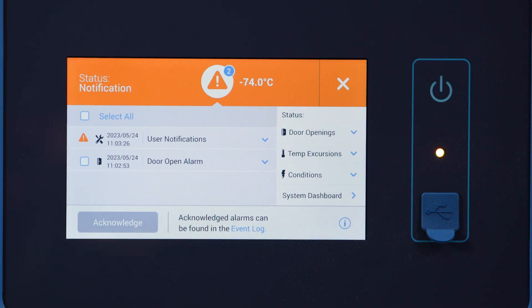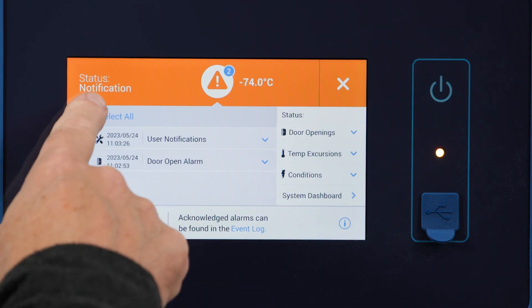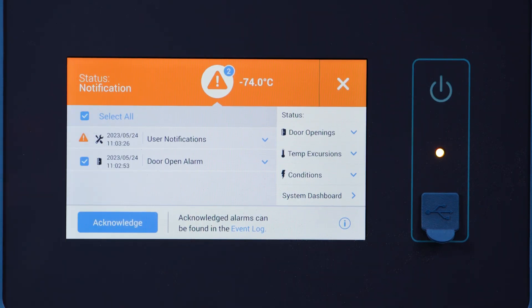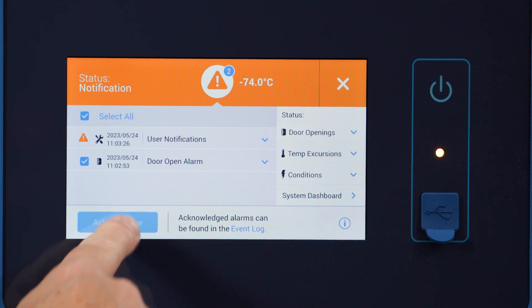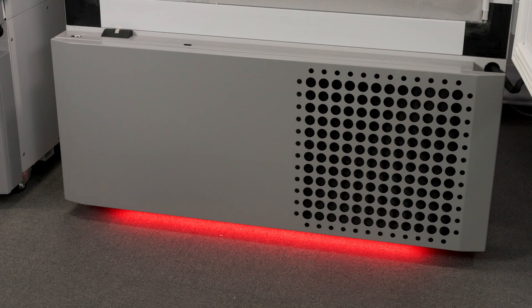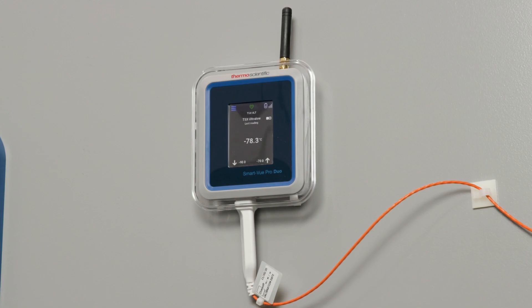The purpose of an alarm is to alert you that your samples may be at risk. You can choose an audio, visual, or an external alarm. The external alarm can inform you of an event remotely.